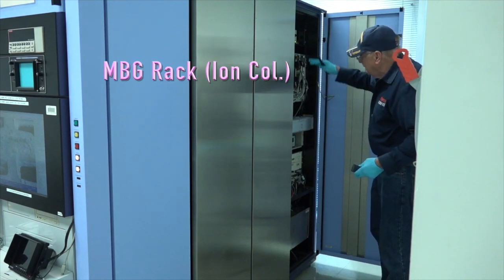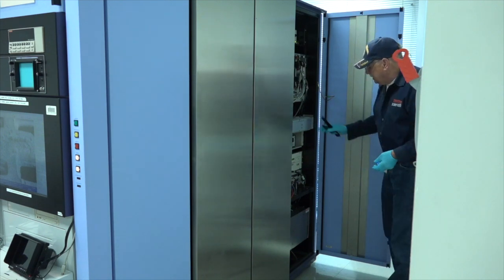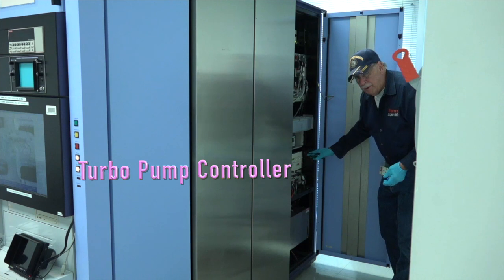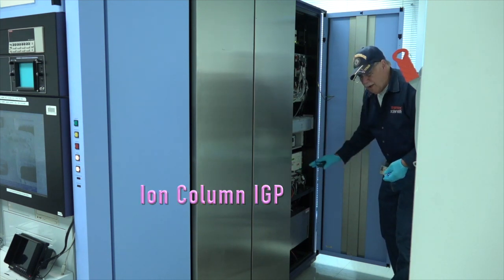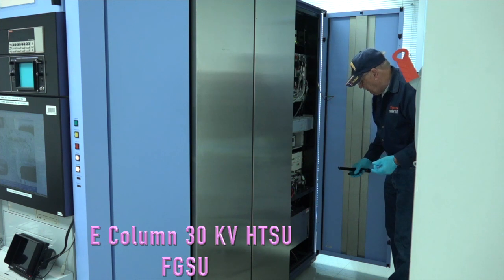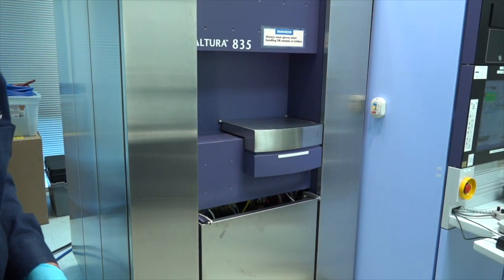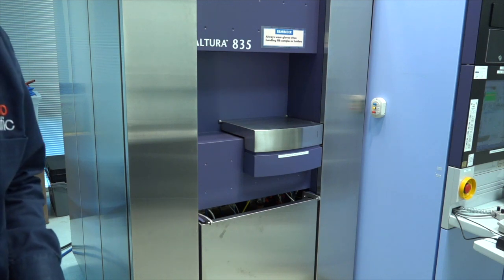Behind this door is the electronics rack for the icon. It's got a flotation table, the spicer field cancellation, and the turbo pump controller, as well as the IGP for the ion column. We have one ion getter pump on the ion column and two on the E column. And the high tension power supply.